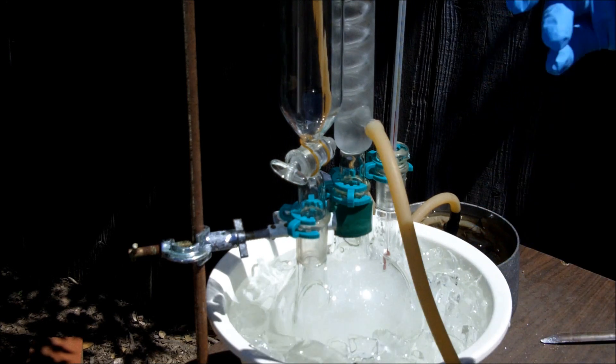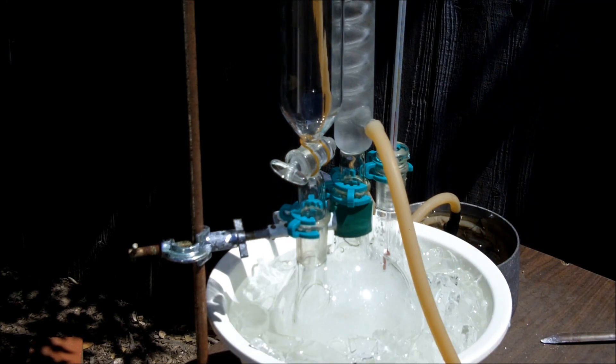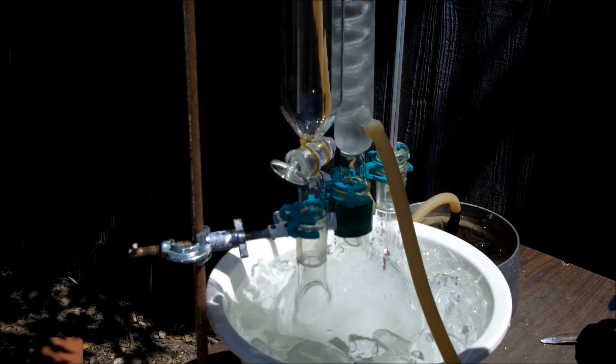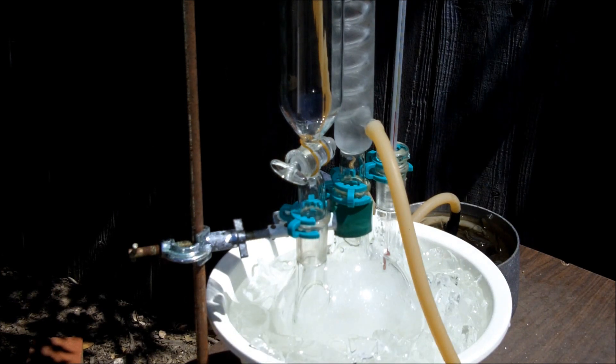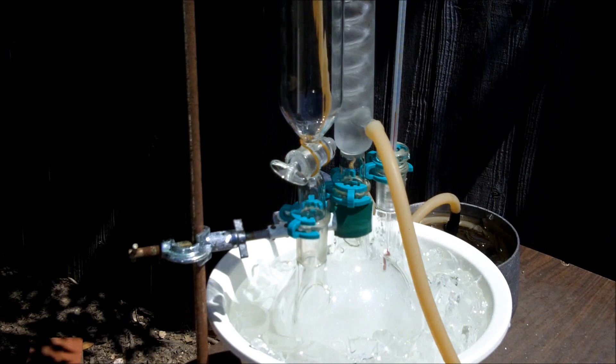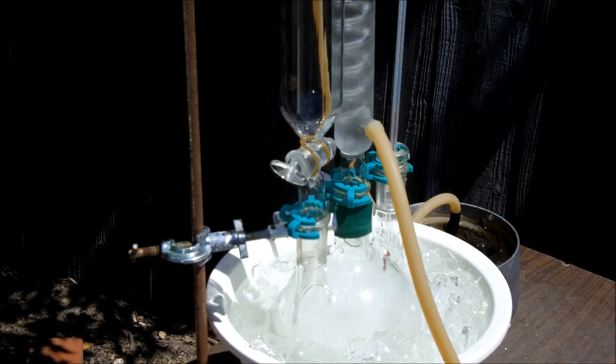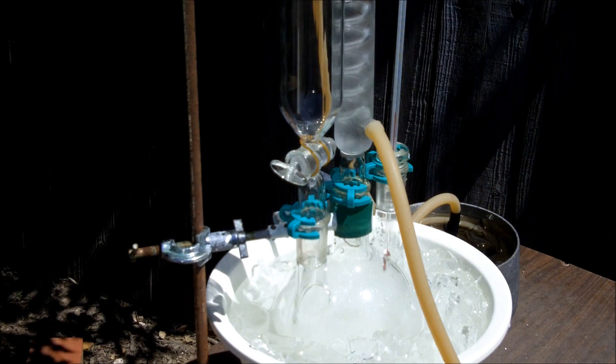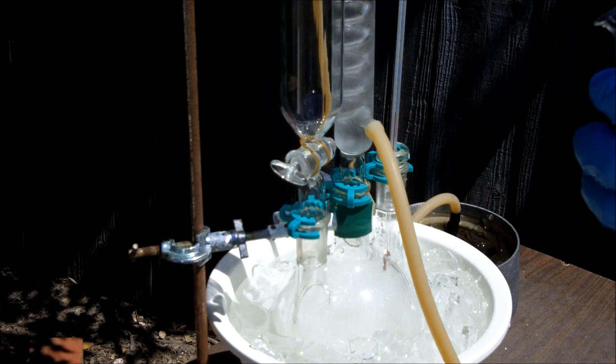I'll pour a few milliliters into that addition funnel. I don't want to get too much in there at one time just in case it were to open without me looking. I'll set a pretty slow drip rate and do my best to watch the temperature as it goes. You'll know this reaction is done because you'll be adding acetone and the temperature won't be increasing.